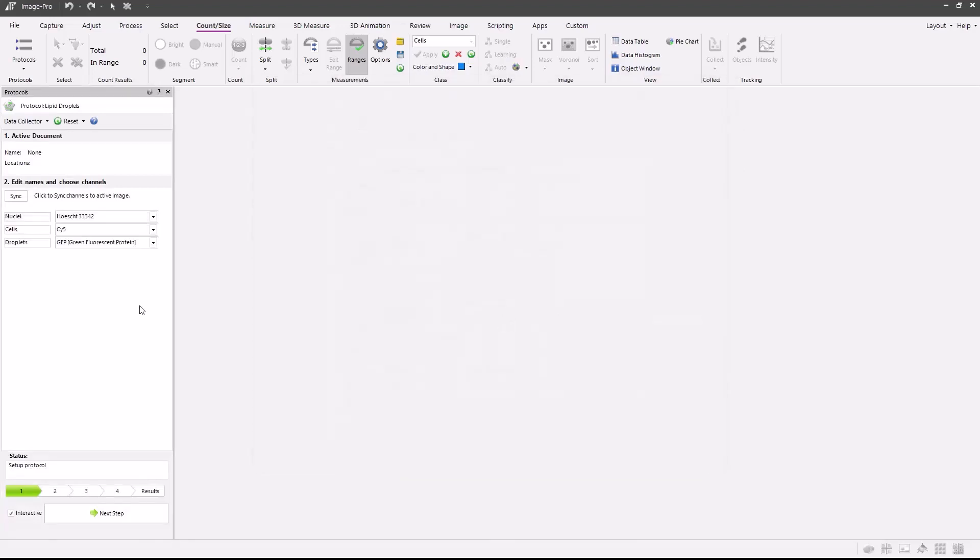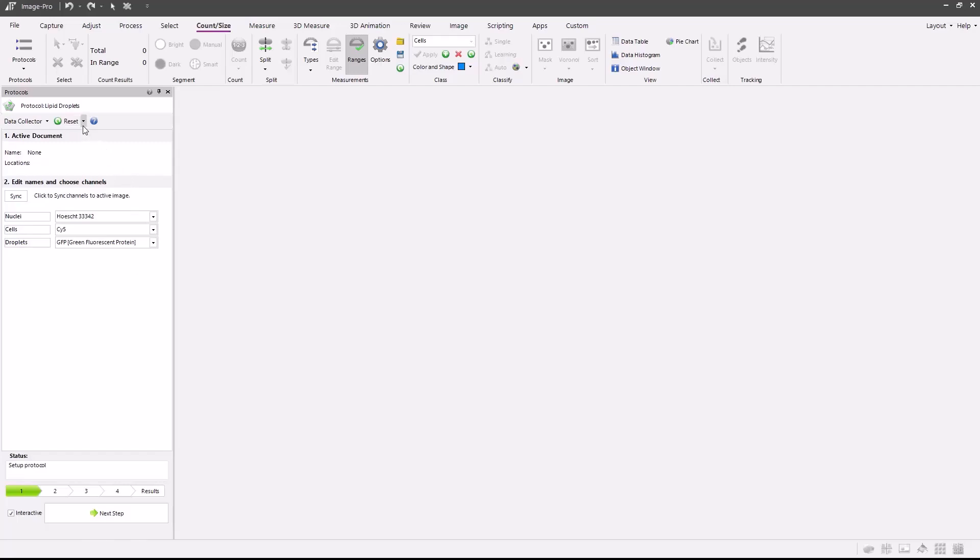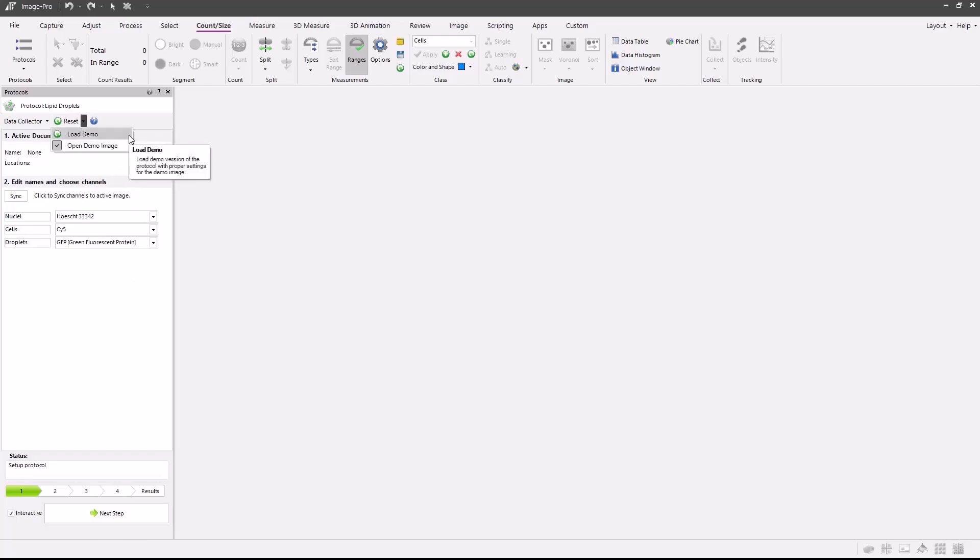Each protocol includes a demo image or set of images. The protocol is set up using the associated demo image. If you're using your own image set, you may modify the protocol as needed and save it for later use. To load the demo image, simply select the dropdown by the reset button and press load demo with the open demo image active.